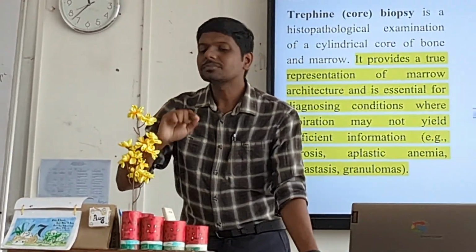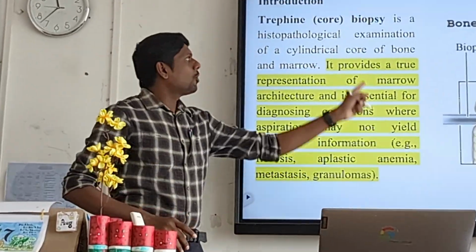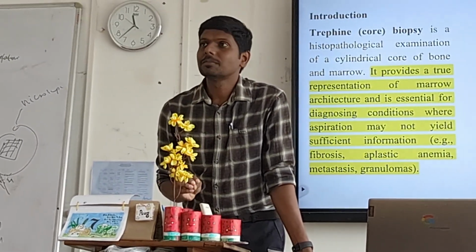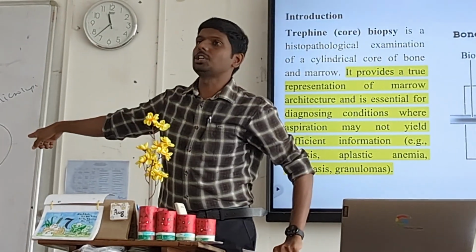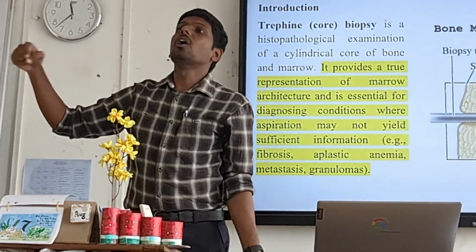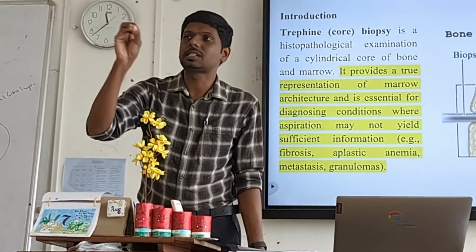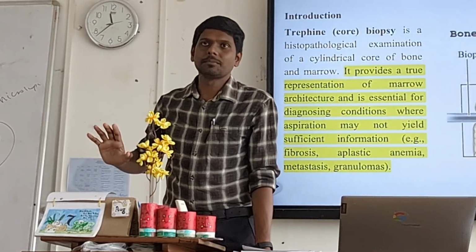Okay. Now listen. Our bone marrow biopsy, of course, has a residual bone, that is calcium. If we directly take bone marrow biopsy and do tissue processing, we are potentially damaging the microtome. Also, we are damaging the sample because we won't get a clear picture. Because the bone particles will interfere with the section cutting.